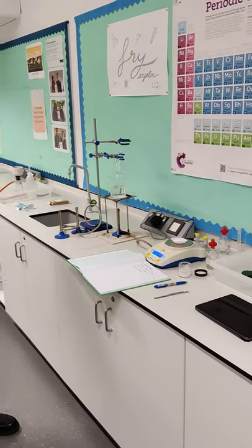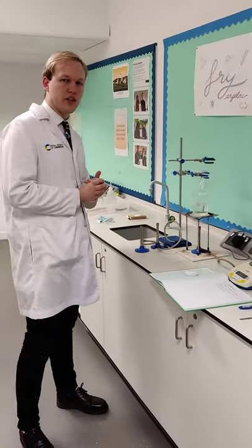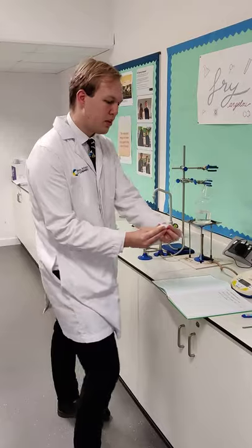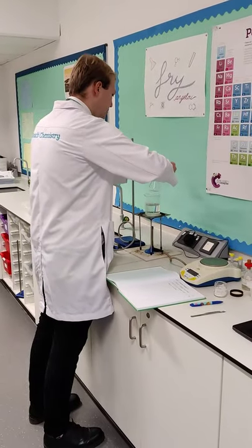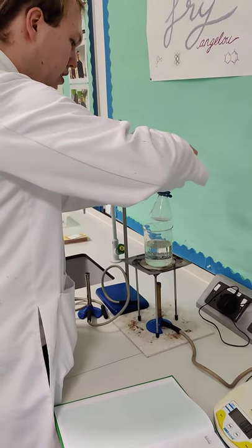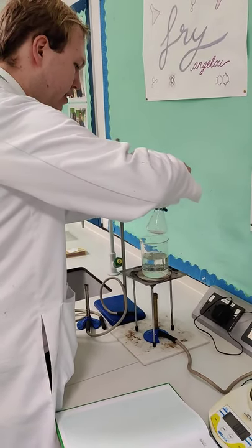So what's going to happen next? The next thing that we need to do is to add this salicylic acid to a 100 millilitre conical flask. The weighing boat is quite nice because you can shape it into a funnel, which makes it very easy to pour. So I'm going to carefully place it into the conical flask. The weighing boat almost gives you a natural funnel — it's very handy.